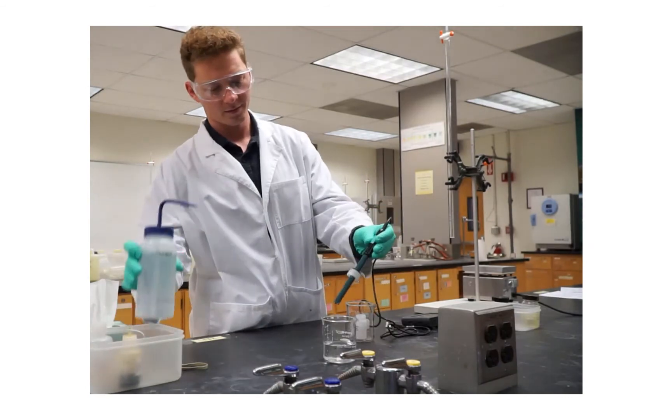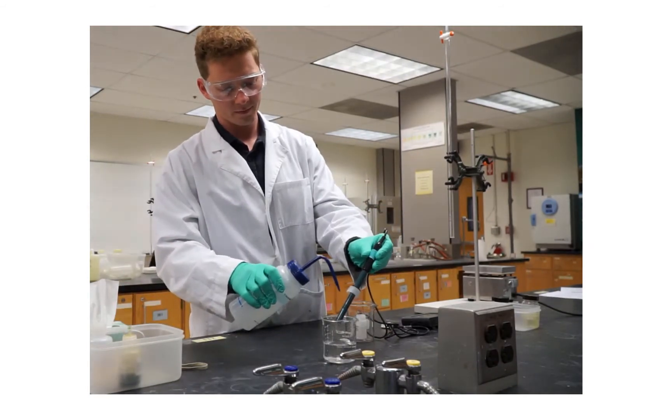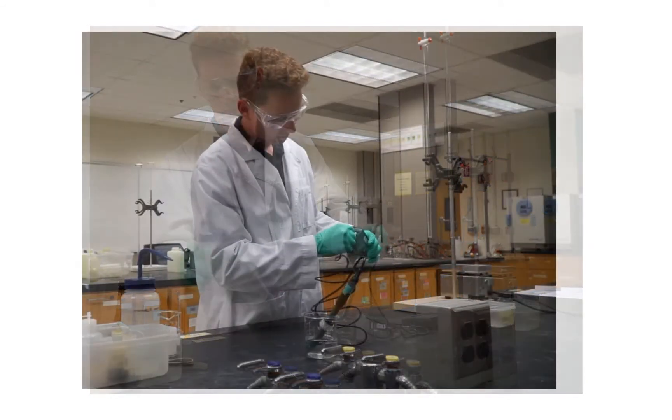To take the probe out of its storage solution, unscrew the cap just enough to loosen the gasket on the probe, which allows you to remove the storage bottle from the electrode.